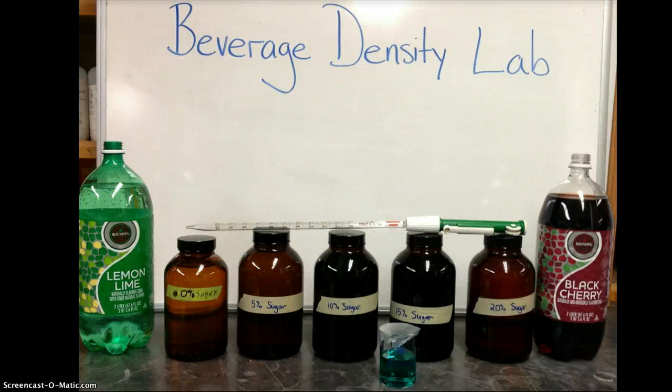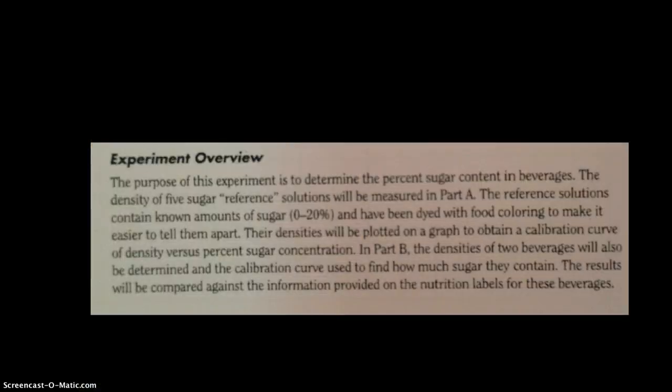This is the Beverage Density Lab Sugar Content Analysis Procedures. The purpose of this experiment is to determine the percent sugar content in beverages. The density of 5 sugar reference solutions will be measured in Part A.